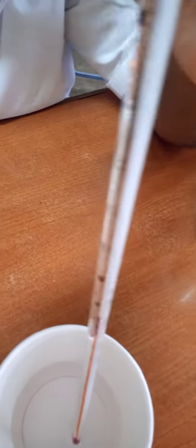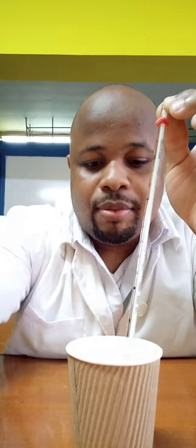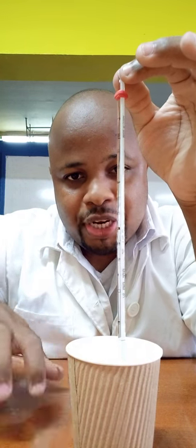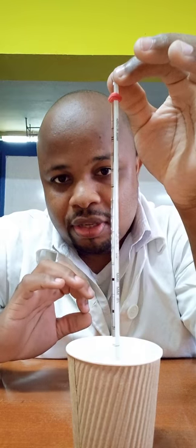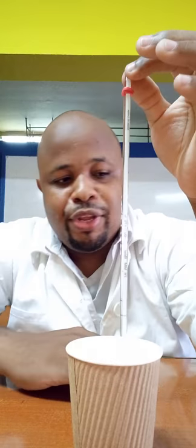You want to ensure that the bulb goes below the liquid, but don't let it touch the corners or the wall of the container or the bottom of it. Just put it inside and allow it to go below the surface of the liquid without touching anywhere in the container. You just want your thermometer to be in contact with whatever solution you are measuring.